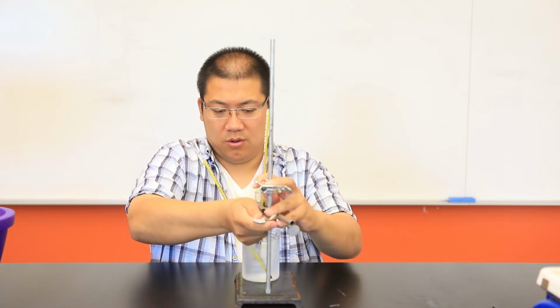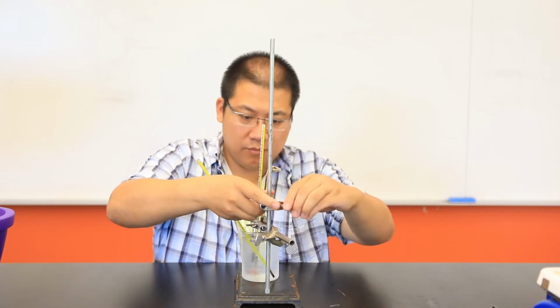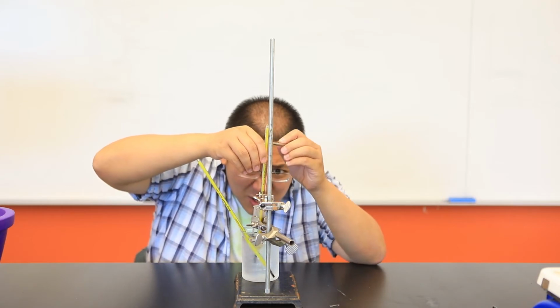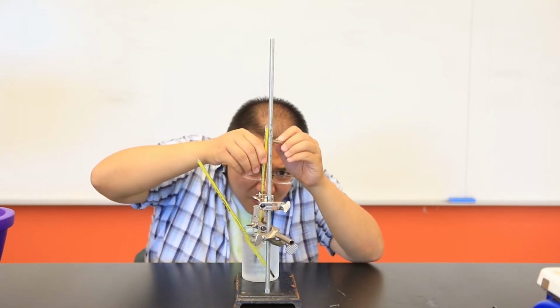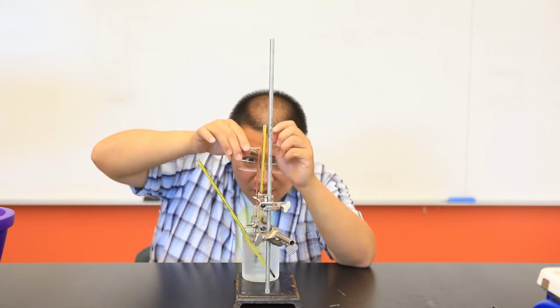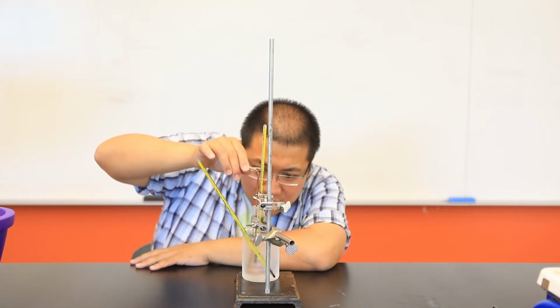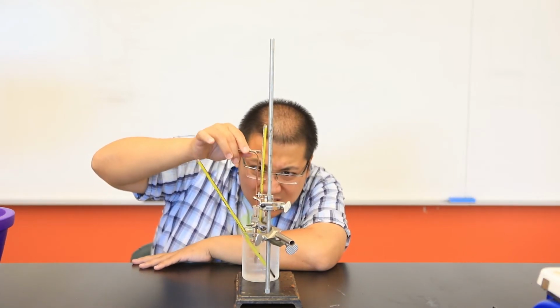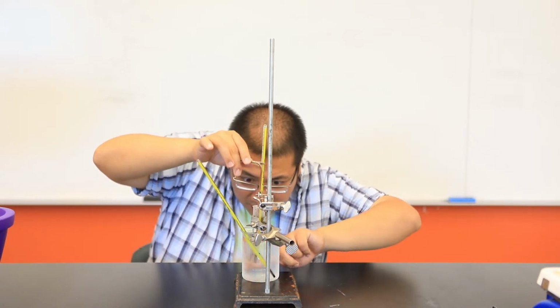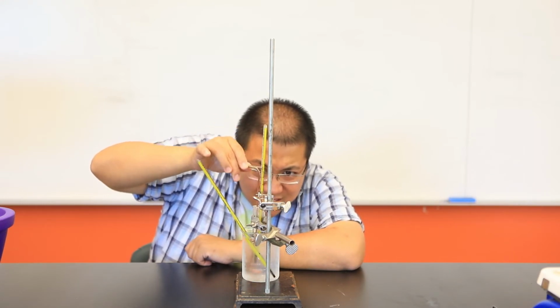So again, we're going to start recording our temperature values. Temperature? 22. Temperature? 21.1. Temperature? 20. Temperature? 19.